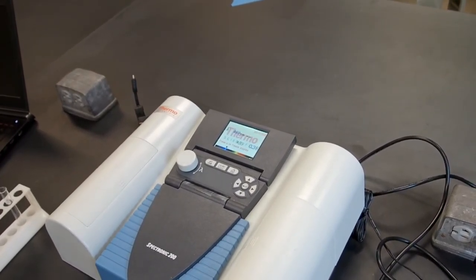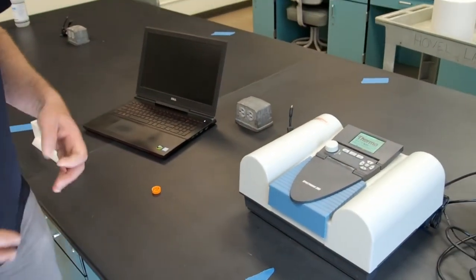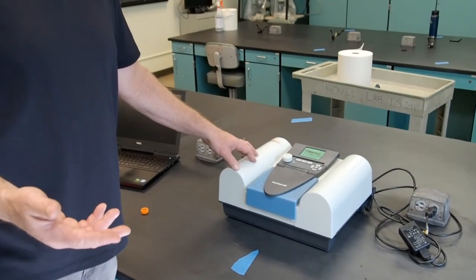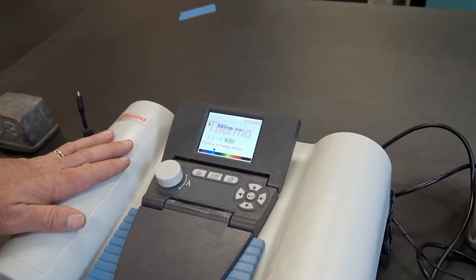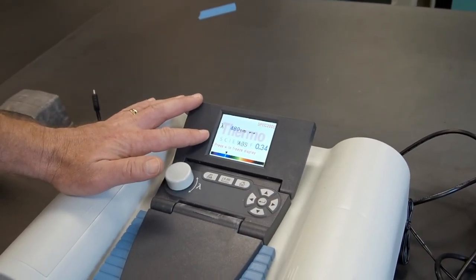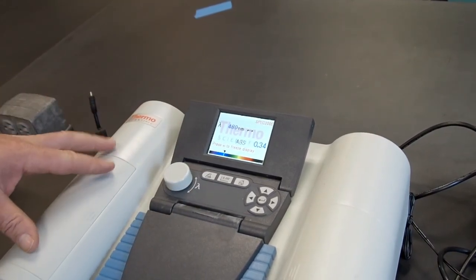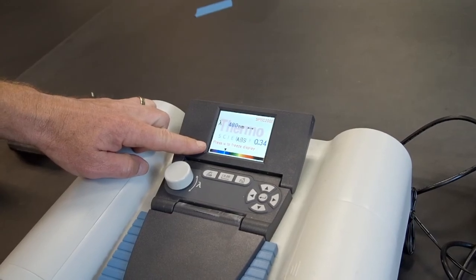And then we're going to read the absorption at other wavelengths that are specified in your lab handout. We're going to use those readings in an equation to figure out how much chlorophyll is in our sample. All right, so we have a sample in there right now at 480 nanometers. One thing on this display screen you can see is the color spectrum at the bottom. Remember, the wavelengths of light represent different colors in the visible light spectrum.